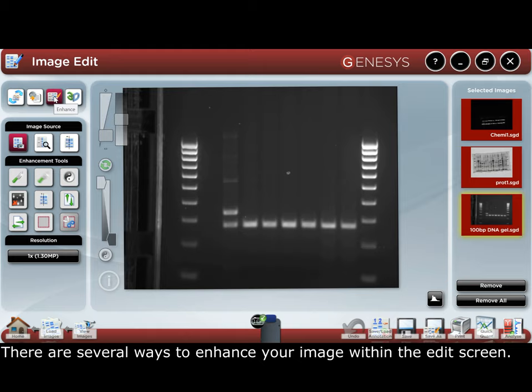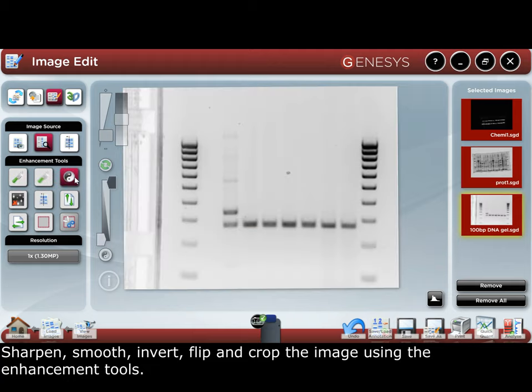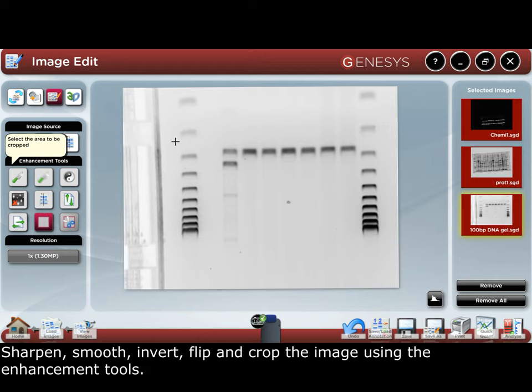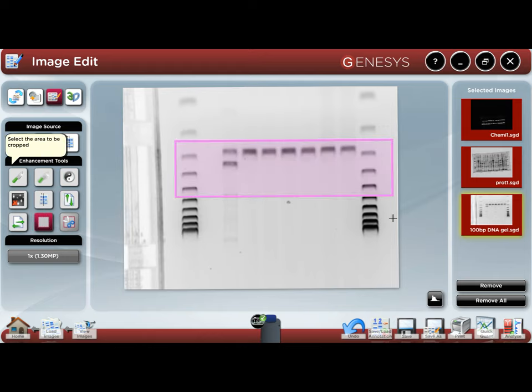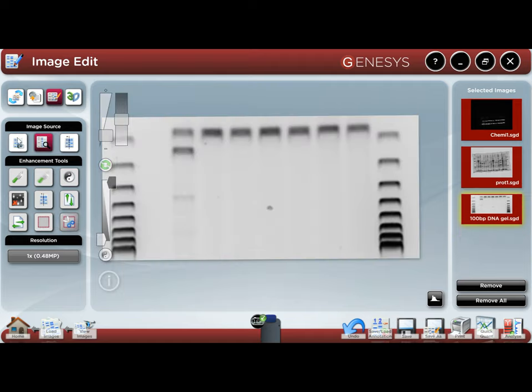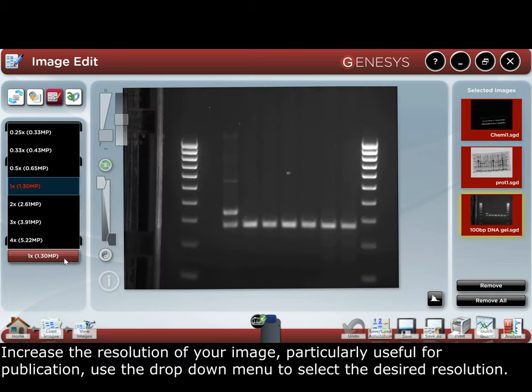There are several ways to enhance your image within the edit screen: sharpen, smooth, invert, flip, and crop the image using the image enhancement tools. You can also increase the resolution of your image, which is particularly useful for publication — use the drop-down menu and select the desired resolution.